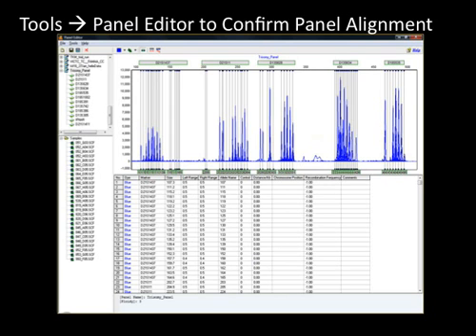Use the Tools Panel Editor link to confirm panel alignment. If run conditions have resulted in differences between the positive controls or allelic ladder and the panel, please refer to the introductory webinar for information on aligning and calibrating panels. If the panel required adjustment, use the Project Rerun option in the main analysis screen to apply the newly saved panel.